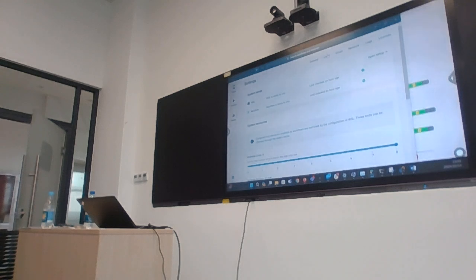I'm trying to see if they tell you about installing the... No. They don't explain here. You must add your user to the Docker group. So you need to log out, log back in. At least I think we're going to need this. Just go check.